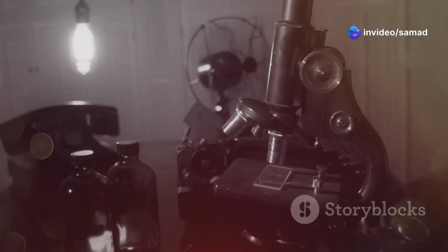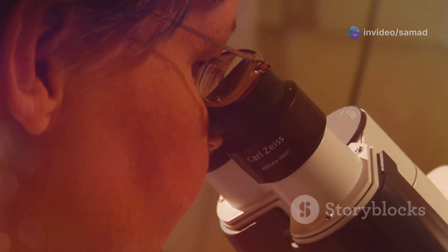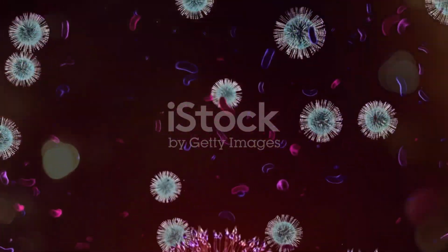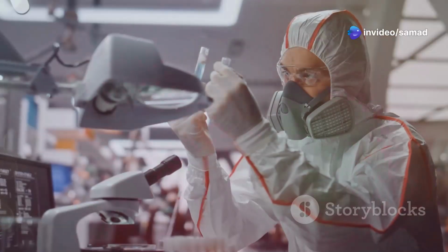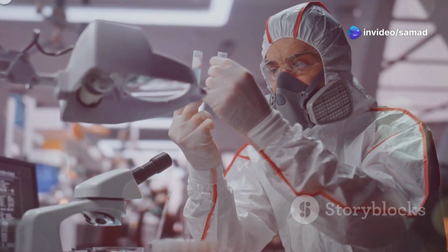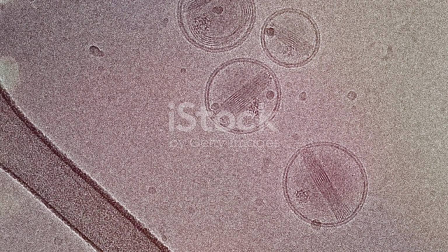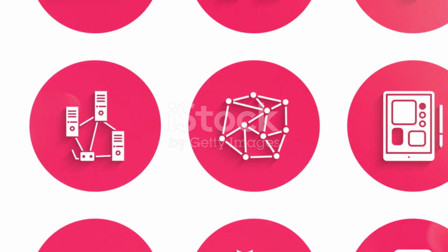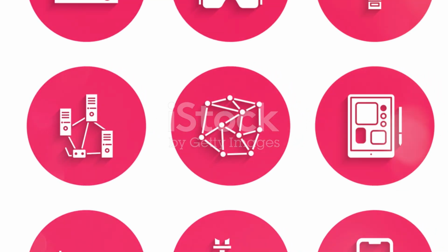The invention of the electron microscope marked a turning point in scientific history. It opened up a new realm of exploration, allowing us to see and understand the world in ways never before imagined. From the smallest viruses to the most complex materials, electron microscopes have become essential tools in a vast array of scientific disciplines. This knowledge has been instrumental in developing new drugs, vaccines, and diagnostic tools. Materials scientists rely on electron microscopes to study the structure and properties of materials at the atomic level. Despite challenges, the electron microscope remains an indispensable tool for scientific discovery, pushing the boundaries of our knowledge.